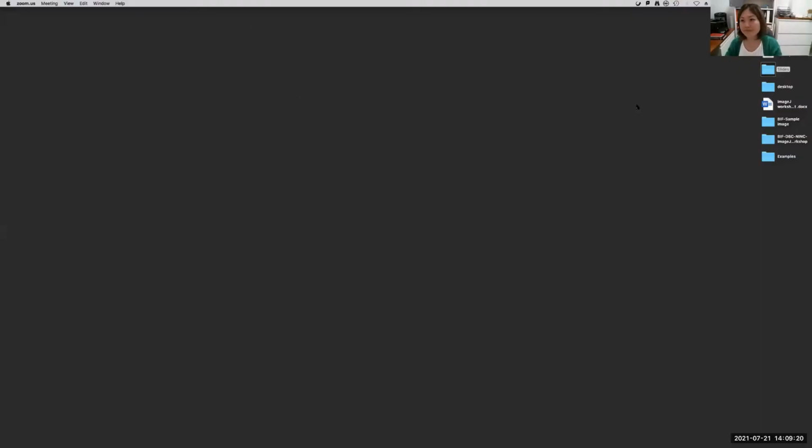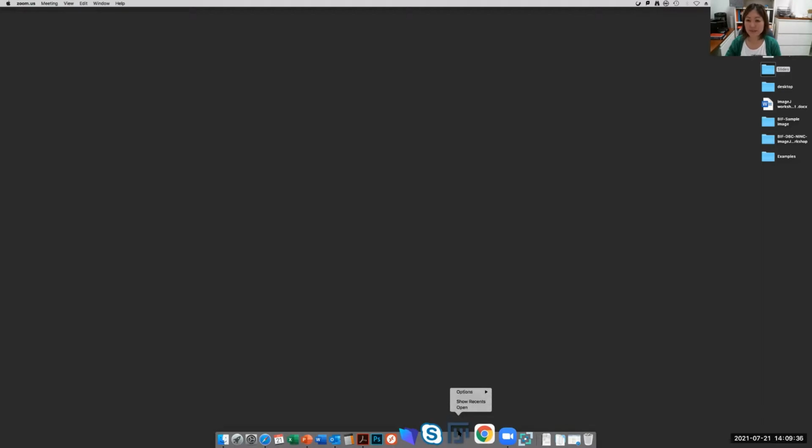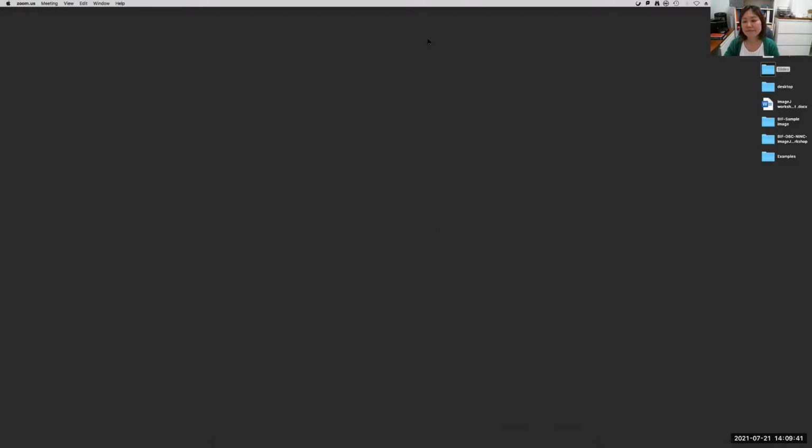And I'm going to start to share my desktop. Can you see my desktop? So I'm using a Mac, and I'm going to open Fiji. Is it opening?